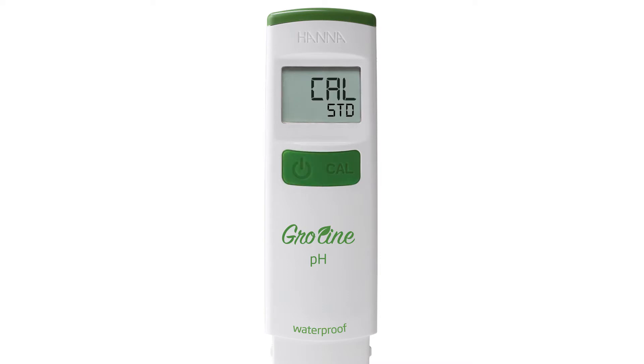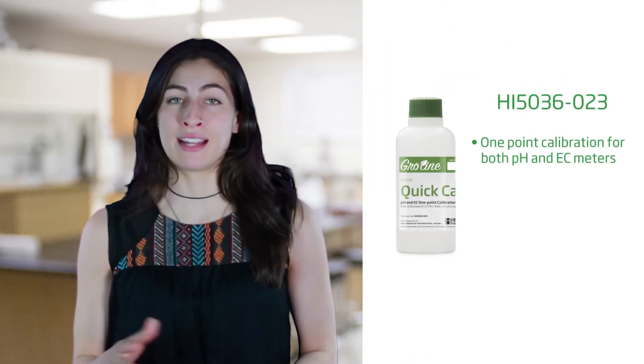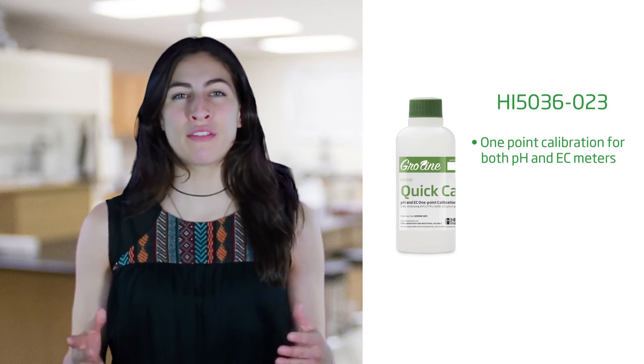The next setting in the menu is your Calibration Type. By pressing the Cal button, you can choose between Cal Standard or Cal Quick. The Cal Quick setting lets you use the Growline Quick Cal Calibration Solution. This solution is for a one-point calibration in both pH and EC meters — it's like having two buffers in one bottle. Once your settings have been set to your preference, the tester is now ready to be calibrated.